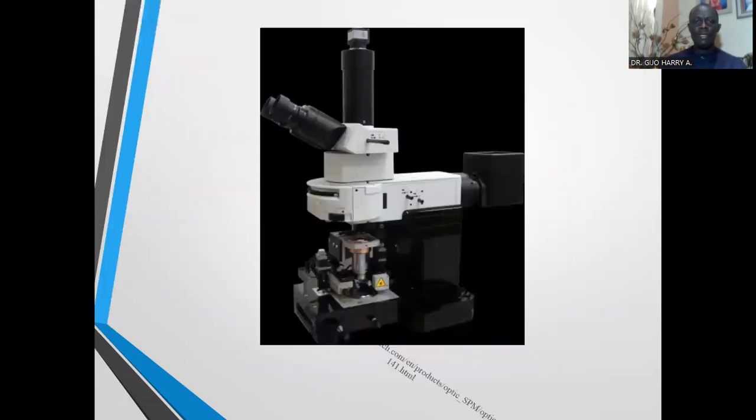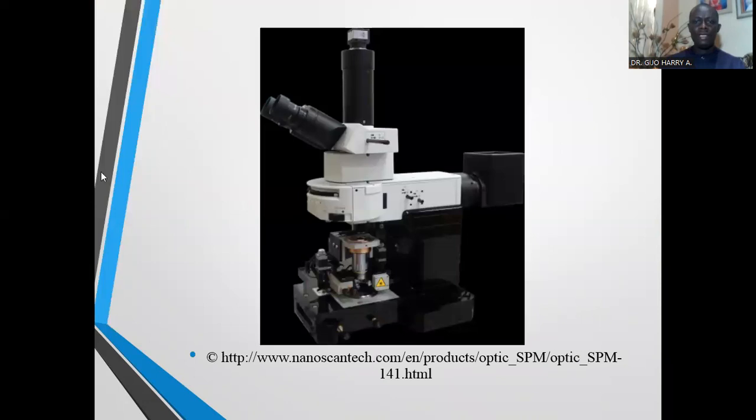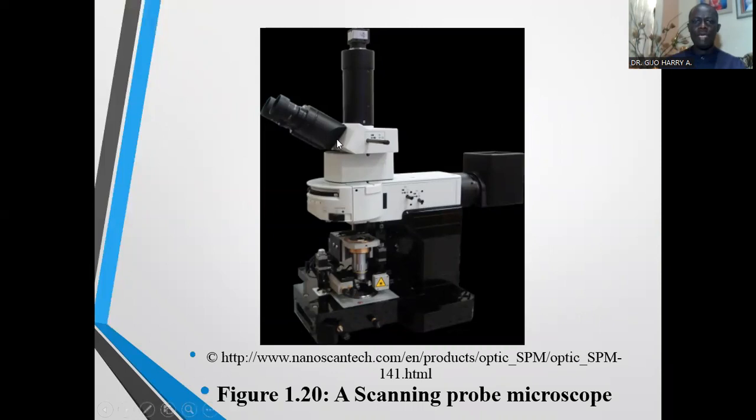Now here is the picture of the scanning probe microscope. Just like the optical microscopes, it has an eyepiece and the stage and other features.